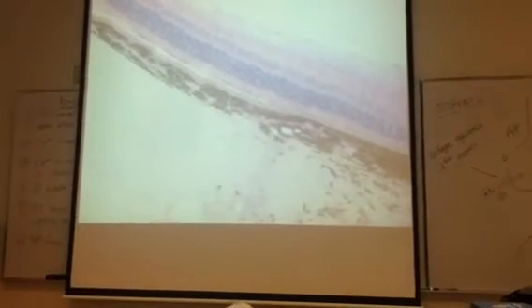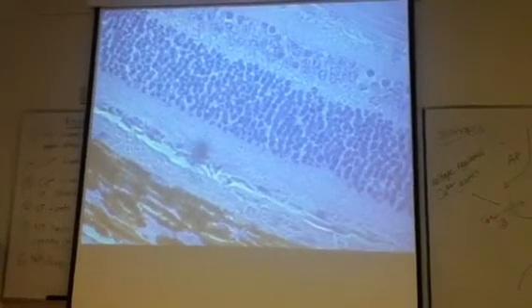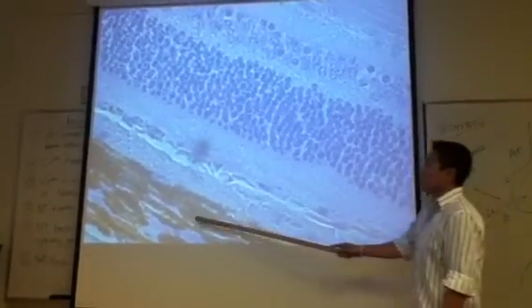All right. I'm going to zoom in really quick. So, this is kind of the same area. I just zoomed in. This is the choroid.